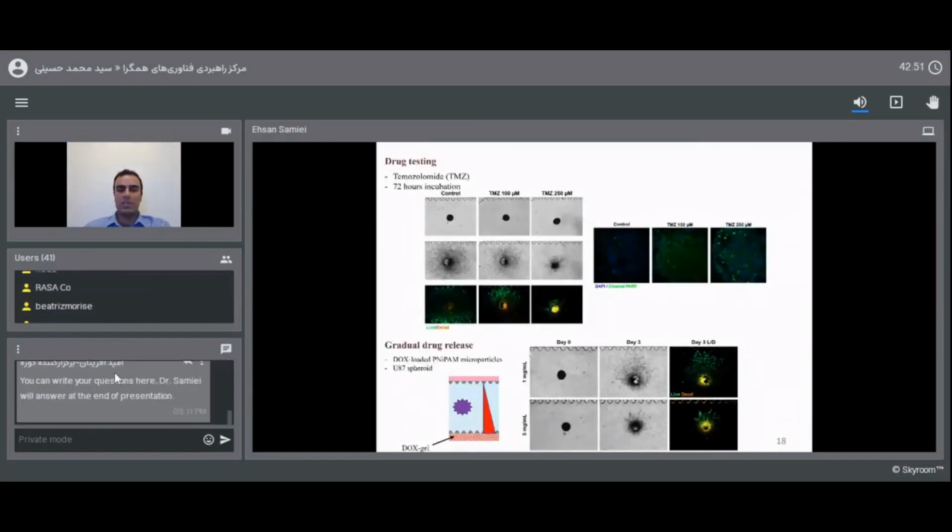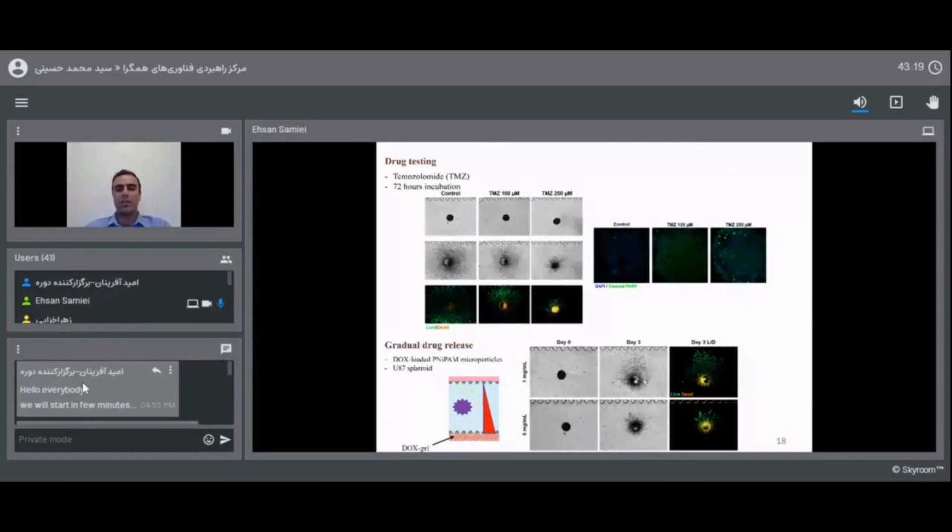Interestingly, when we observed the invasion of the cells, that pattern was clearly observed. On the lower side, which is the side where the drug was delivered, there is no significant invasion, as you can see in both live-dead and bright field images, and for both concentrations of the drug. Whereas on the opposite side, the level of invasion was significant.